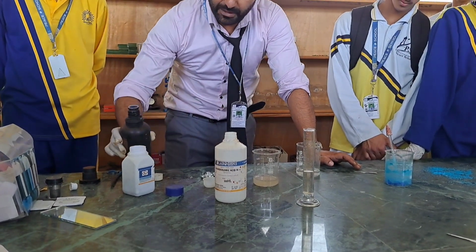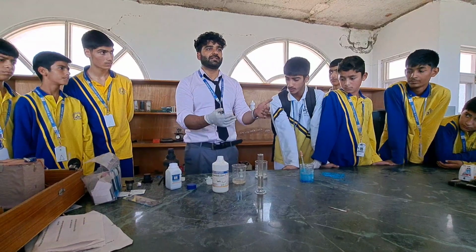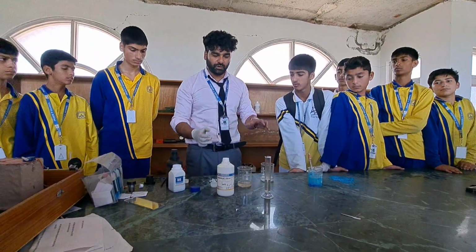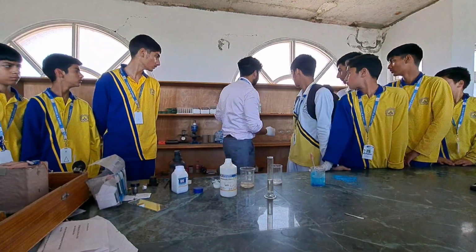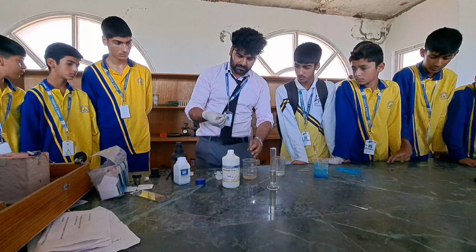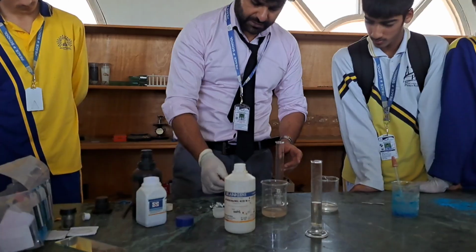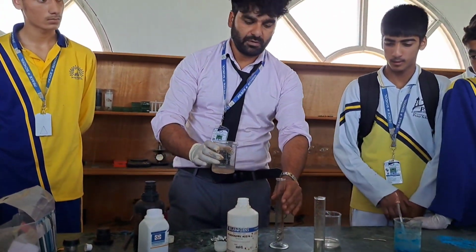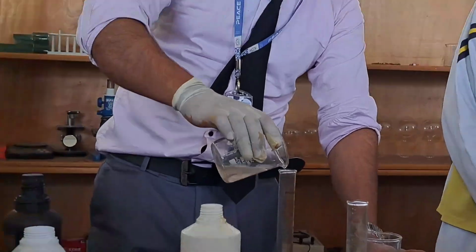Listen, I have told you how to make a dilute solution. Should we put acid in water or water in acid? Acid in water, because the heat produced gets absorbed by the water. Now wait for a moment. I will take another beaker, a flask here. I will take again these zinc crystals into it. Putting some zinc crystals into it. Now listen, have a look here. I will pour this solution into it.